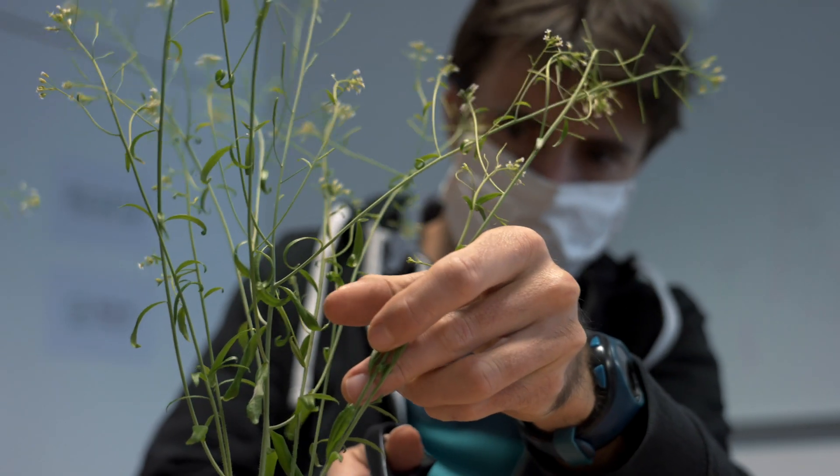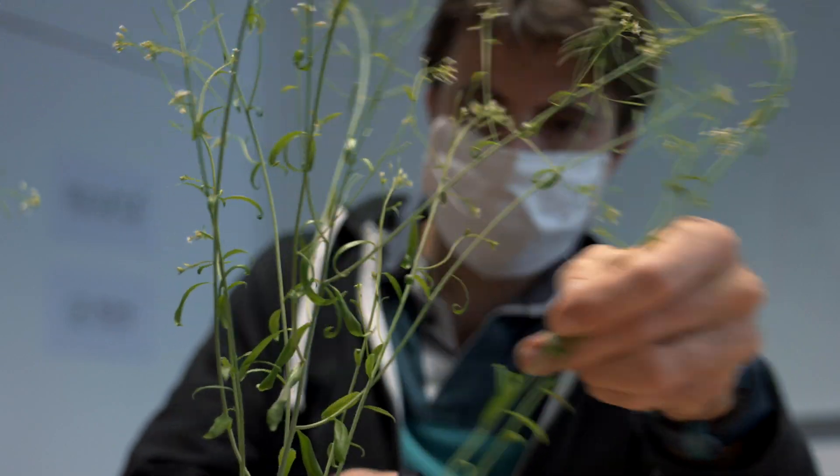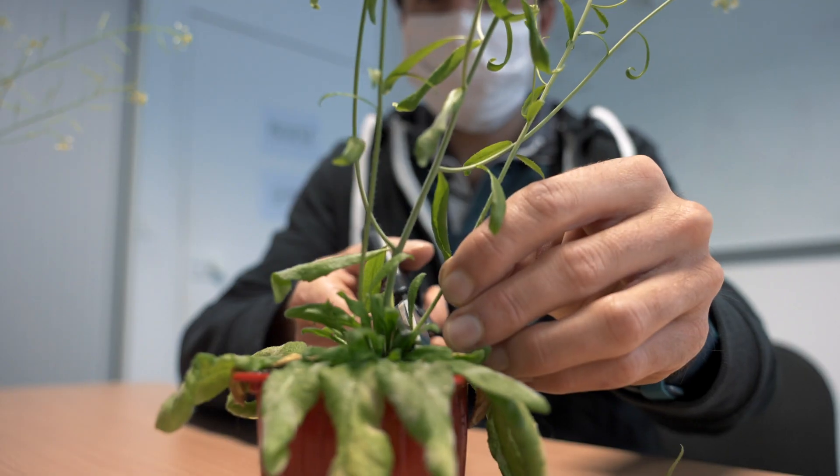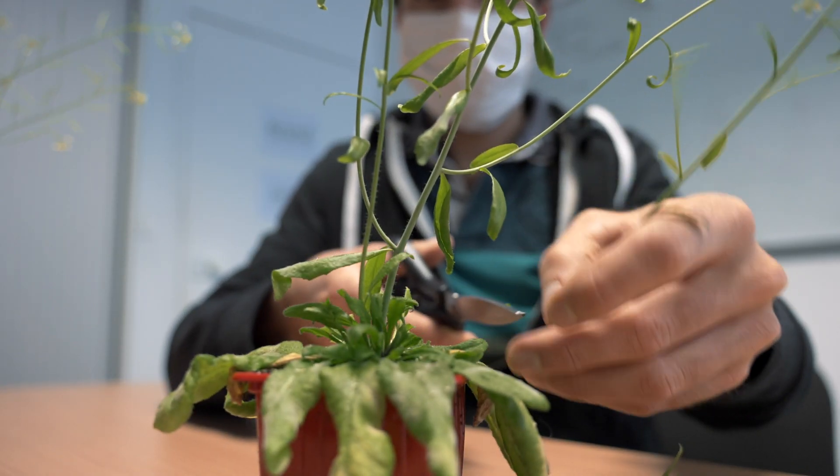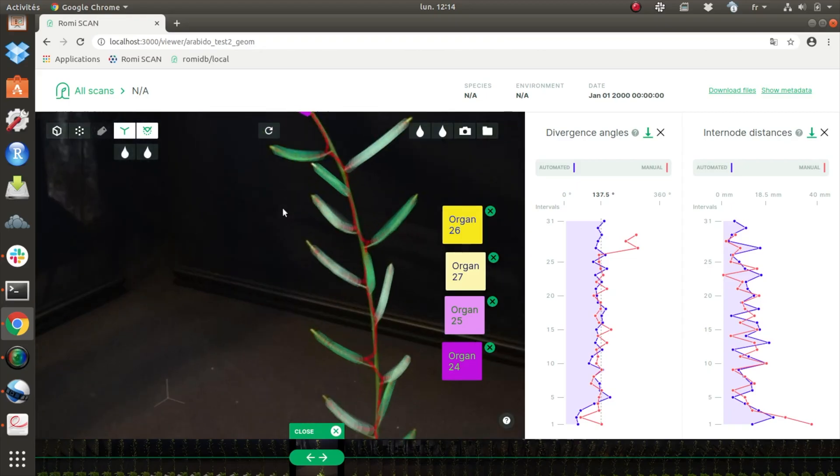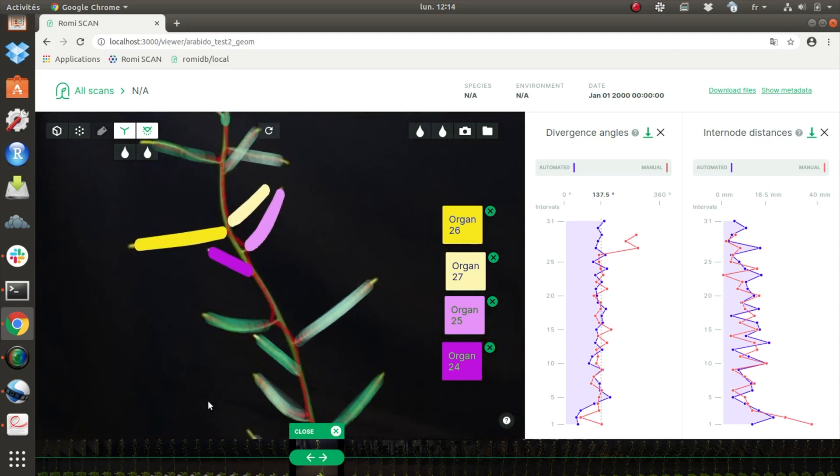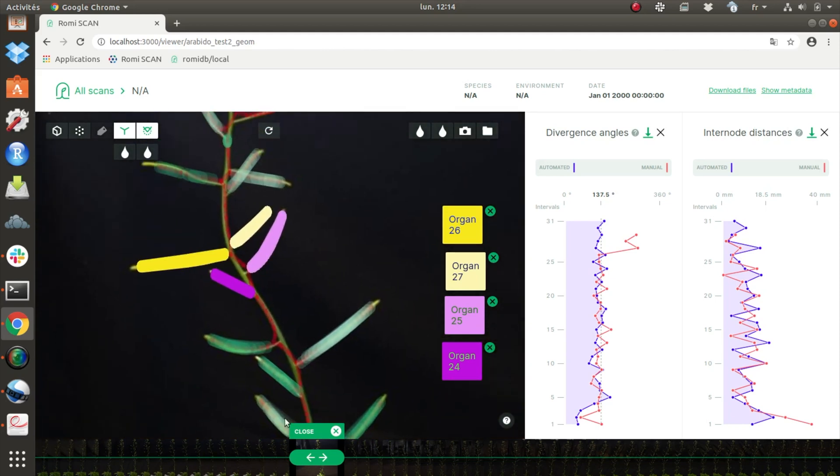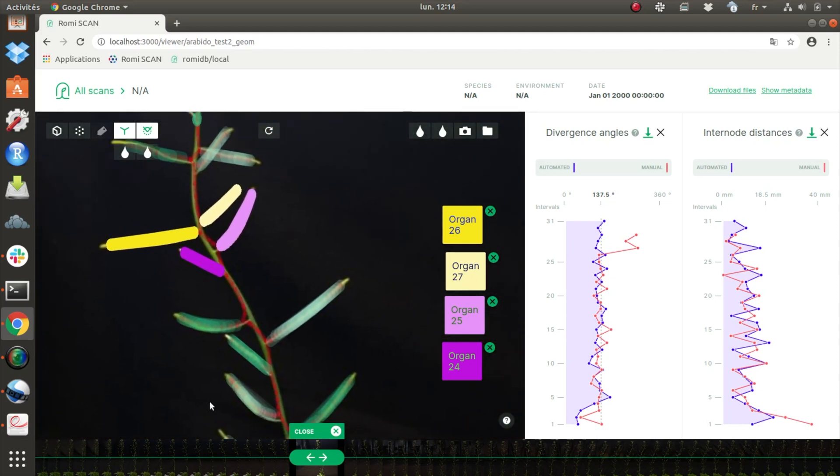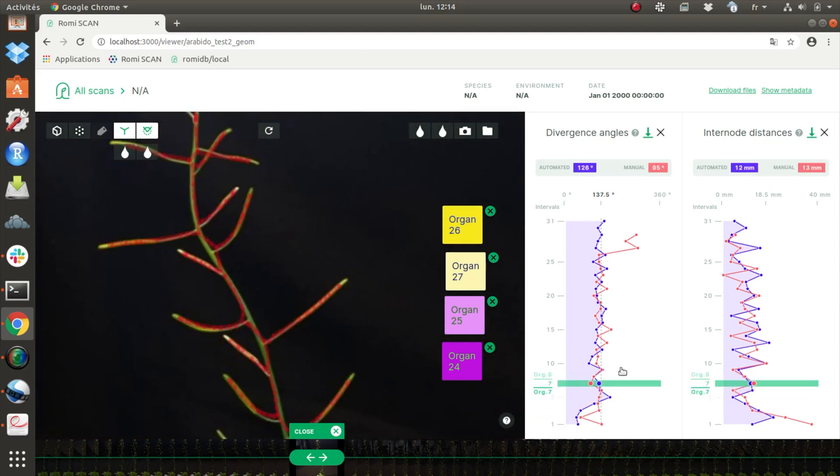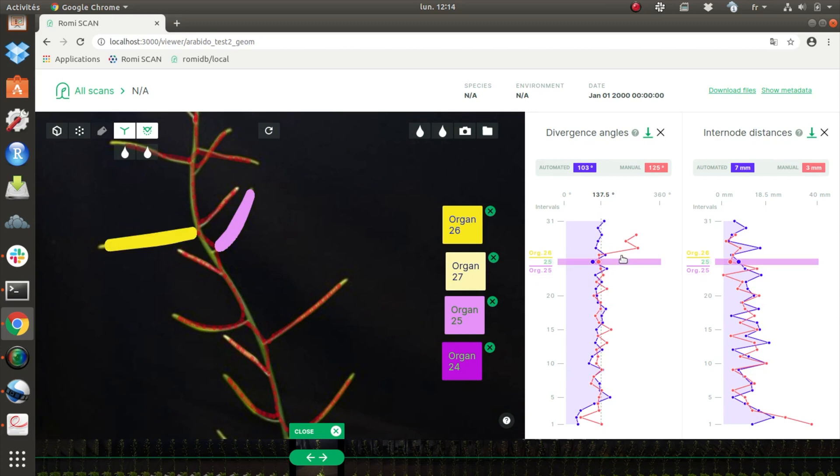The Romi project has developed a proof of concept scenario using a challenging task: measuring the inflorescence phylotaxis of the model plant Arabidopsis thaliana.